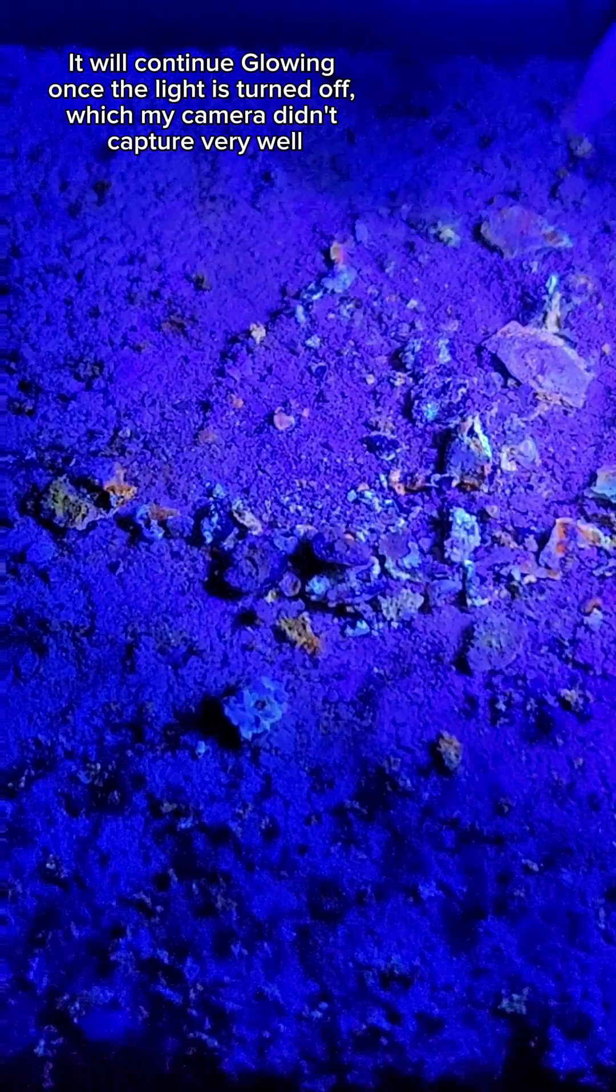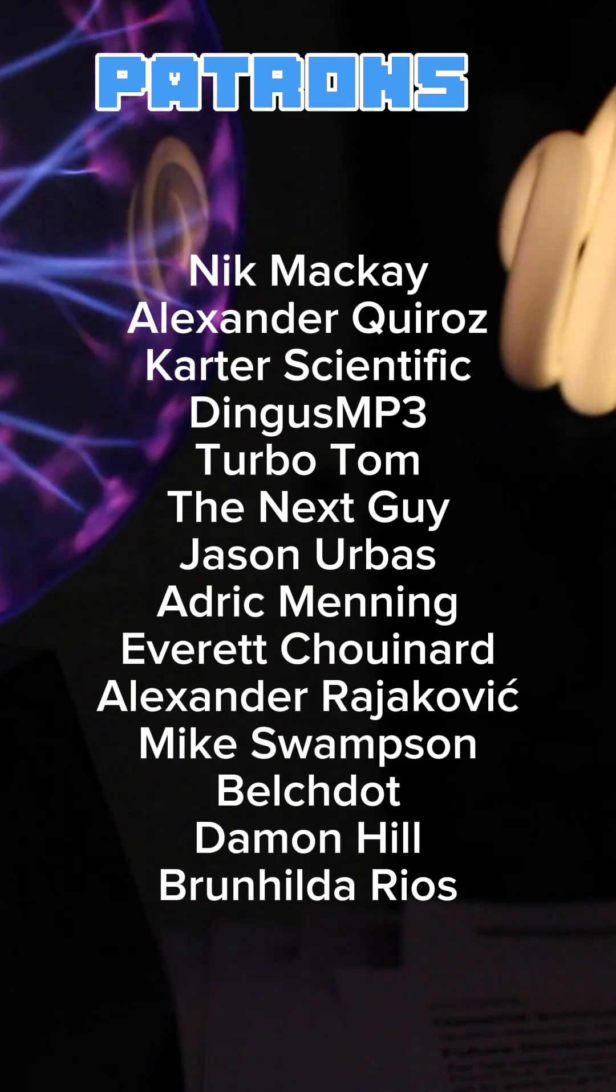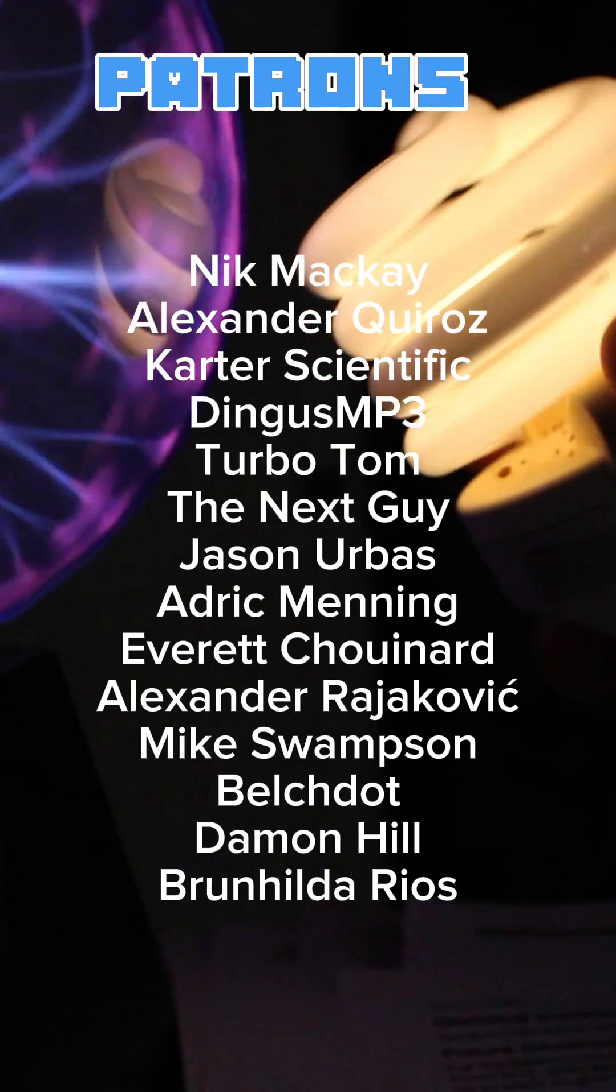Another unique property is that zinc sulfide will continue to glow after the UV source has been removed, which you can kind of see here. I actually intended to do a much longer video on this, but the process ended up being a lot more sensitive than I thought it would be, so I'm shelving it for now.